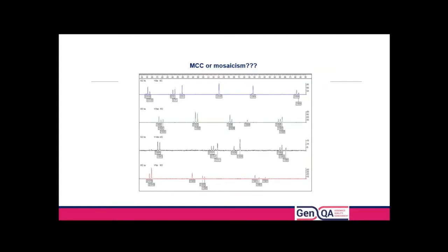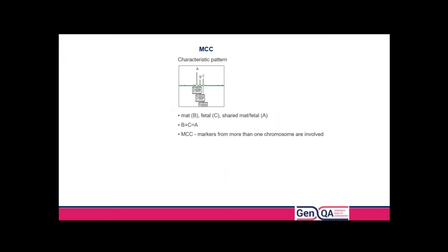The difference with maternal cell contamination is that you're going to see it affecting every chromosome, so it's not specific to just one chromosome — all markers will be inconclusive in some way. You can see lots of markers showing three peaks but in a different ratio, and the characteristic pattern is: a maternal-only allele, a fetal-only allele, and a shared allele that the fetus has inherited from the mother, where the maternal and paternal alleles are different sizes.